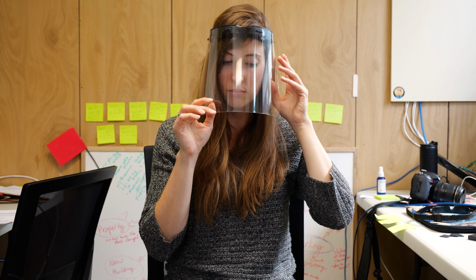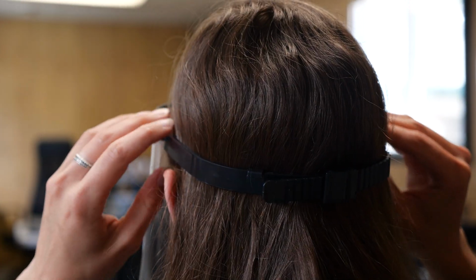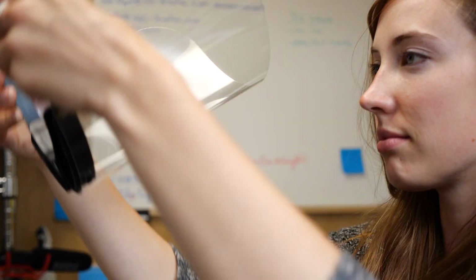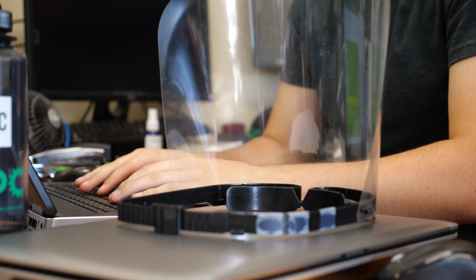To remove your Shield U, avoid contact with the visor as much as possible as this will be the surface that becomes potentially contaminated during use. It is recommended that using both hands, you hold the headband above your ears and lift the headband vertically away from your head. To prevent damaging your Shield U, it should always be set down on any surface headband first with the visor standing upward.